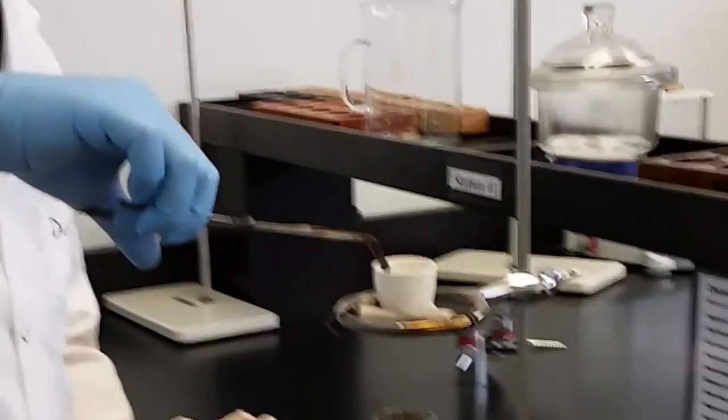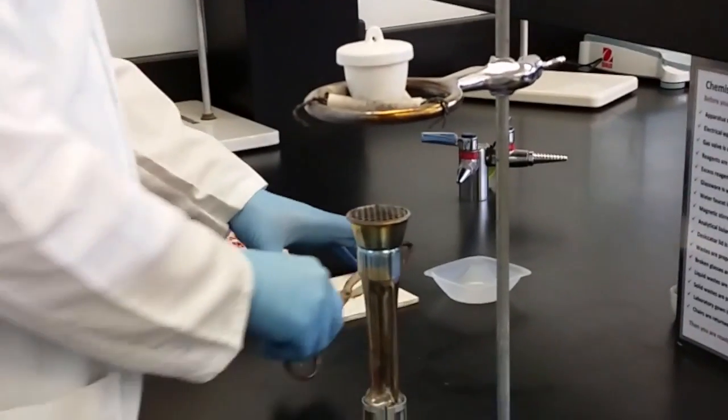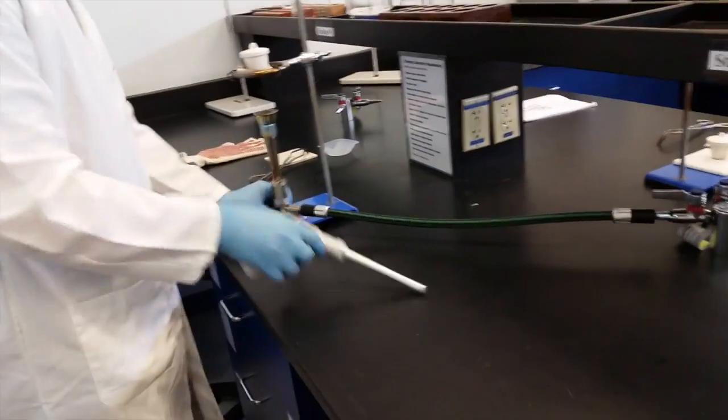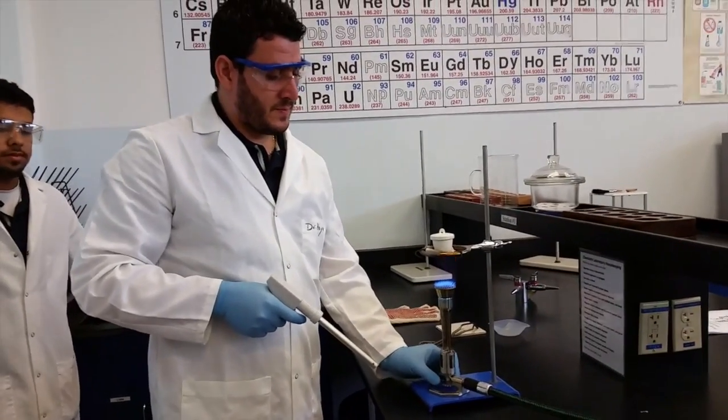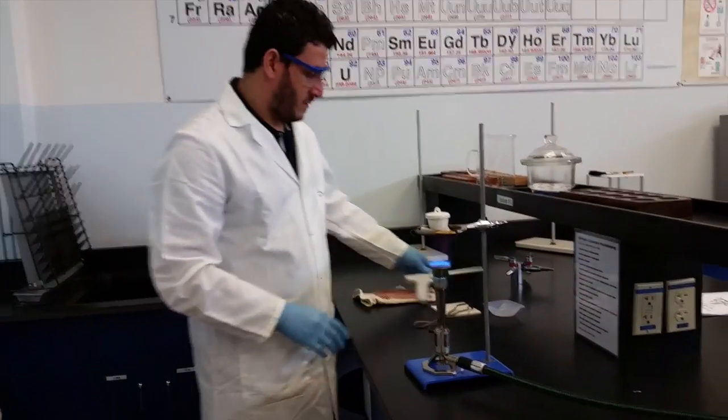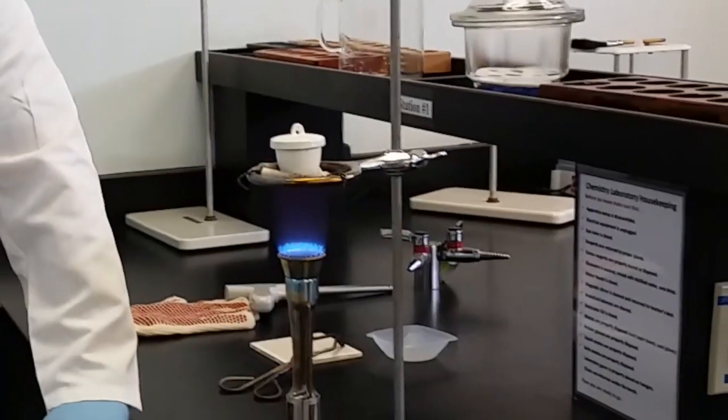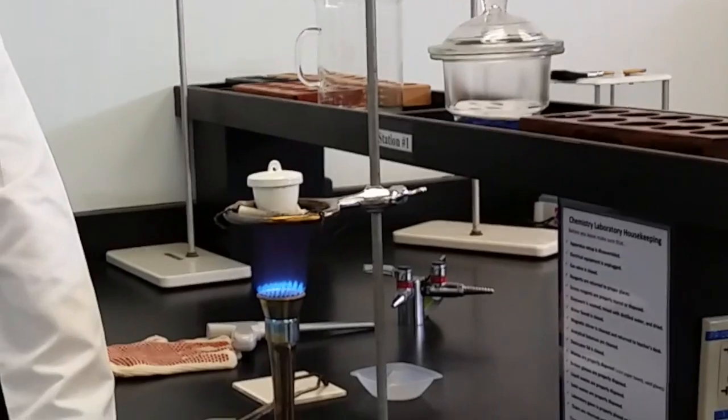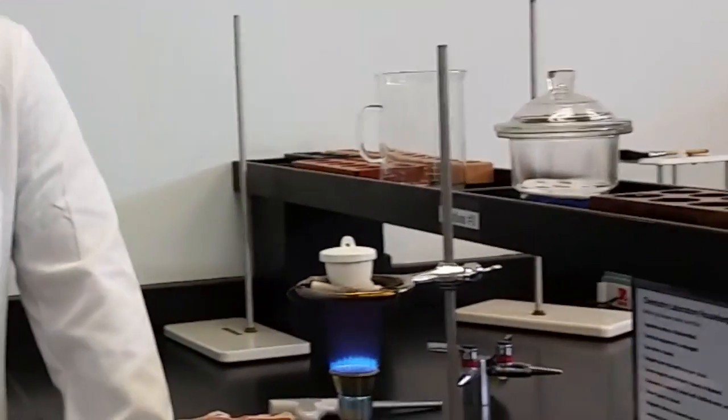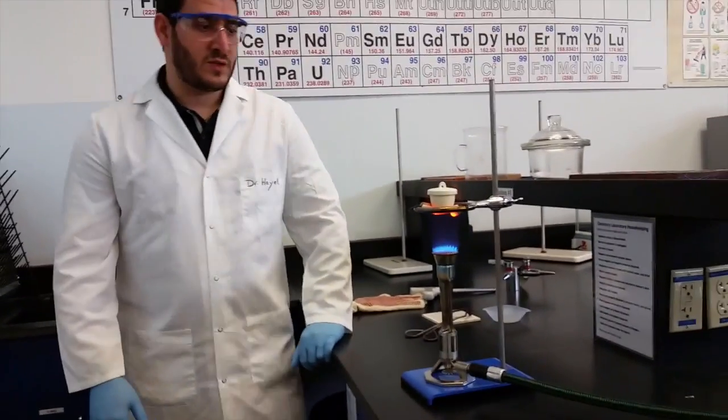I will take my crucible with the solid, put it on the triangle plate, cover it, and start the burner. If you keep looking at the bottom of the crucible, the bottom should get red. Once it gets red, after that you need to wait 20 to 25 minutes.